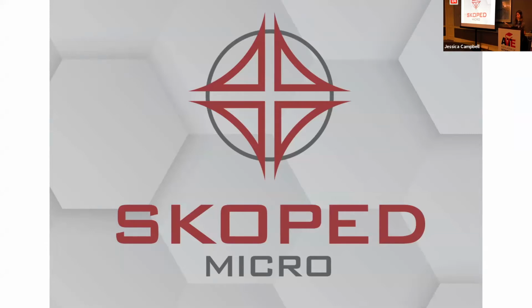So that's our app. Go on your Apple App Store or your Google Play Store and download that app. Everything we're doing is the free version of the app. For participating, we're going to give you a coupon code that gives you full access to the app. We're sort of beta testing it now. We're pretty confident in it, but we're still always looking for feedback.